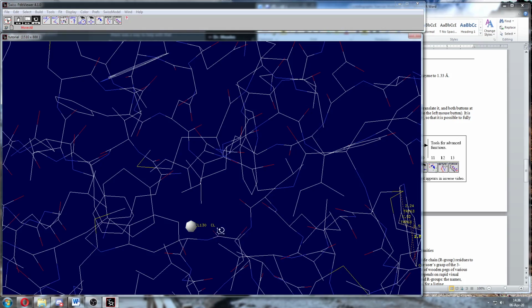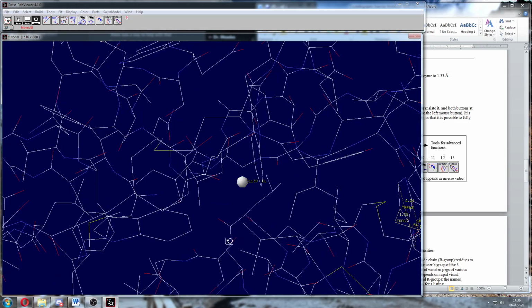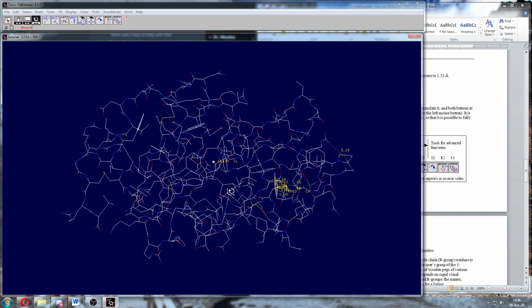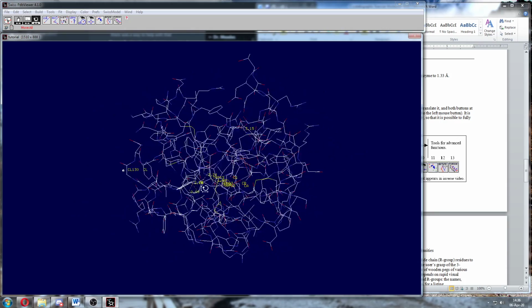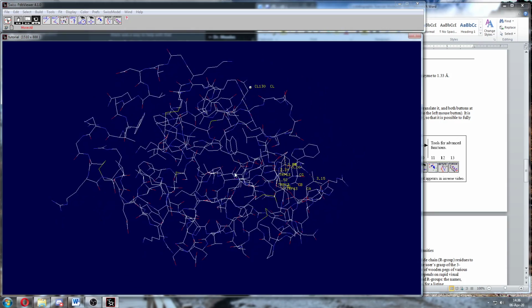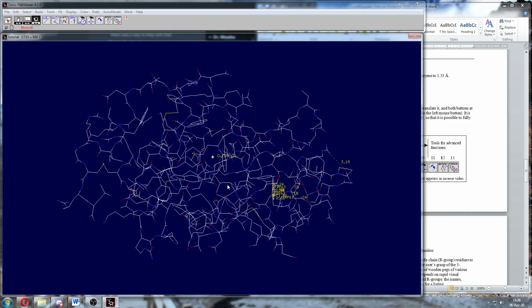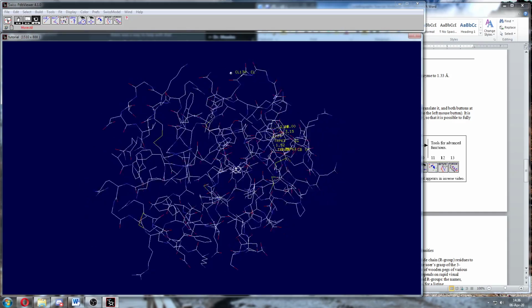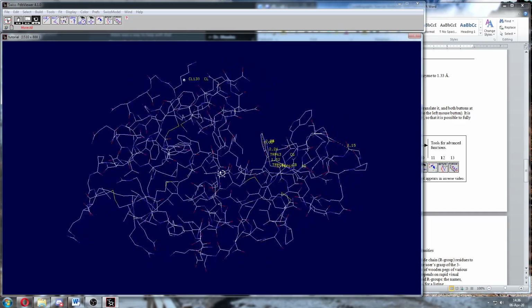What is it? It says Cl. So just sitting there, it's not your normal metal. What is it? Cl. We can't type in lowercase in this program, unfortunately, so it's a chlorine atom. Okay. If there are any others in here, we should see those as well, but this is just a chlorine that's just sitting out there in the structure.